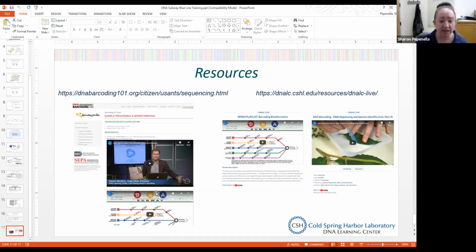This is an 8-minute video that walks you through DNA Subway very quickly, but if you need just a quick refresher, that's a nice one to take you through it. If you're looking for something more in depth, I have a DNA barcoding video on the right here. It says DNA sequencing and species identification part 3. I did a 3-part series over the summer on DNA barcoding. This takes you a little bit more in depth into sequencing. If you loved the sequencing and want to learn more about sequencing, that and sequence analysis.